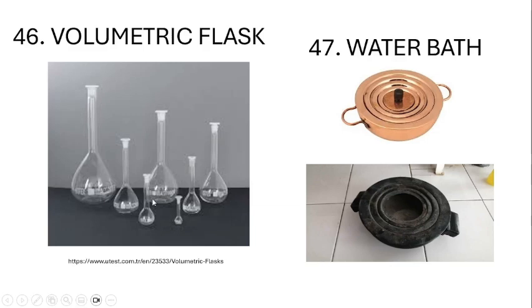Next is your volumetric flask. So it also looks like a pear. And then your volumetric flask is used for standardization of solutions. So it comes in various sizes, and usually it's being used when you're going to standardize an aliquot of a sample, or an aliquot means a portion of a sample of solution that you're going to titrate later on.